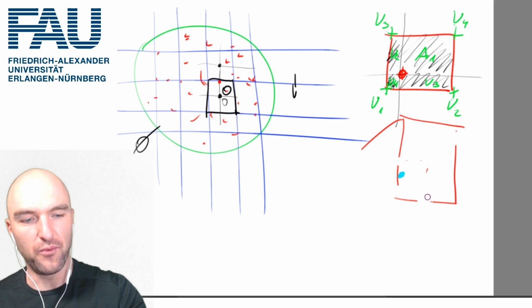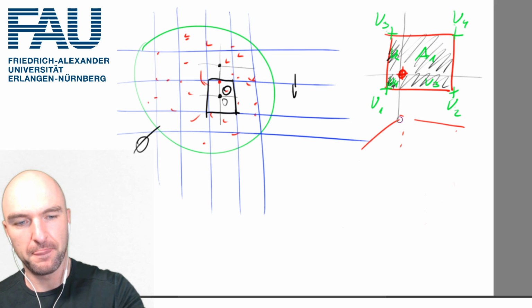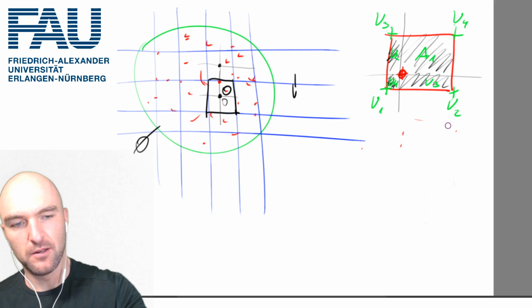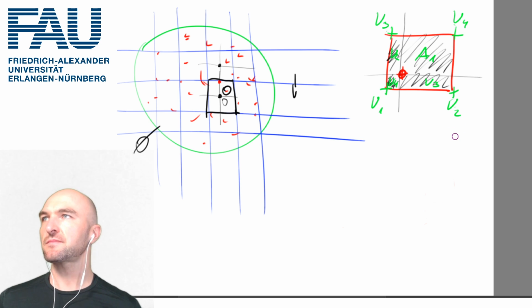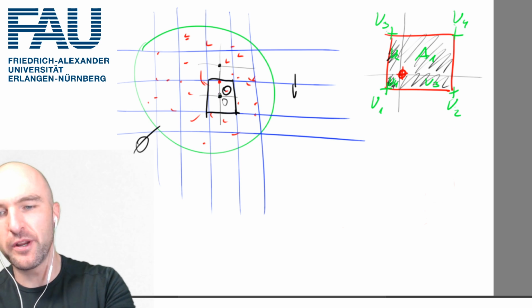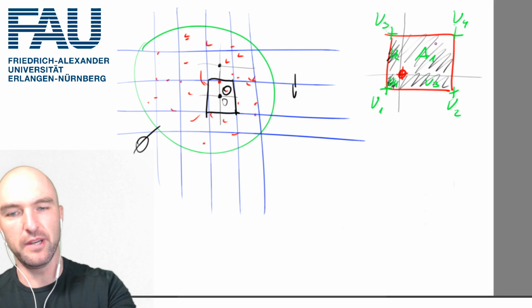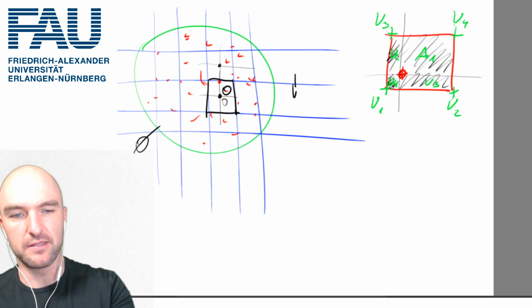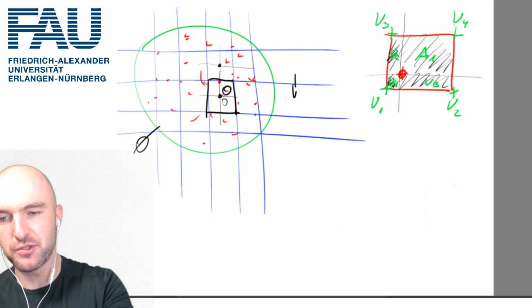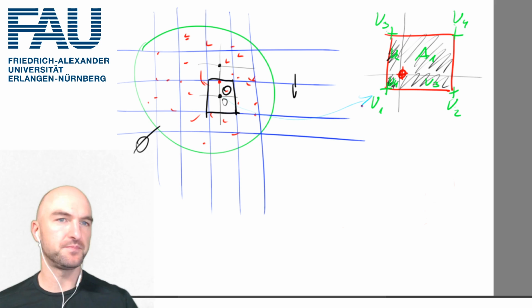So you just go for the volume that's essentially opposite the vertex, the respective corner, because obviously the origins make up a grid, but also the corners make up a grid. So this grid, in this case, would be the origins, and one of those would be one of those. So it's a shifted grid.